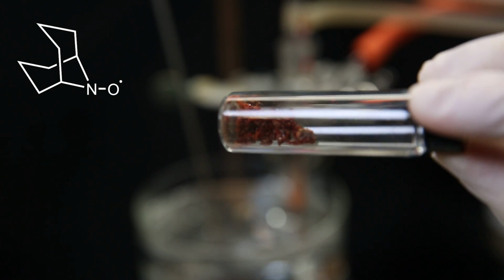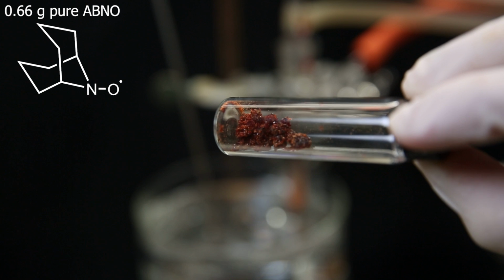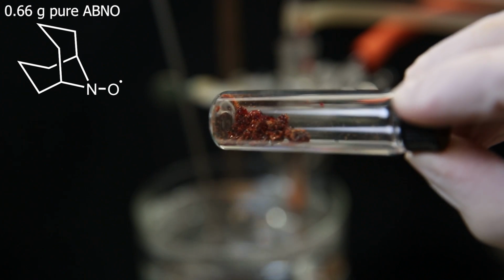Anyhow, I now have some beautiful red crystals of pure ABNO. In this run, I recovered 0.66 grams of the ABNO crystals. I'm happy that it worked, and perhaps I will use it in a future video if I ever need to oxidize an alcohol. Anyhow, that was it for this video.